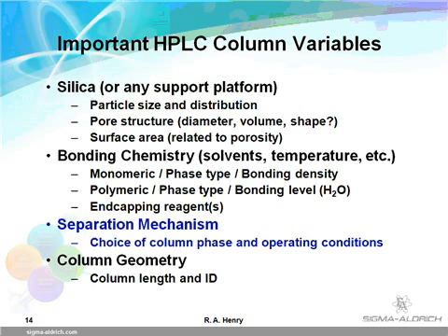A second follow-on reaction with a smaller reagent is called end-capping. It is done primarily to reduce the amount of silanol interaction with bases and give sharper, more symmetrical peaks. All column particles with bonded phases are not end-capped. Separation mechanisms are determined by choice of bonded phase type and mobile phase. The RP mode or mechanism will receive primary emphasis. Column dimensions will not be covered, although they are a very important aspect of HPLC method development.